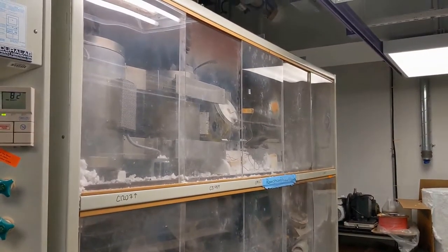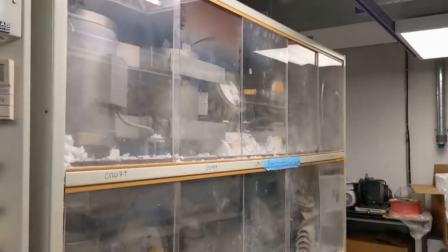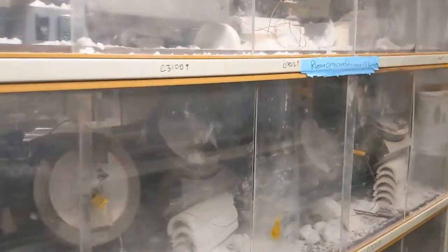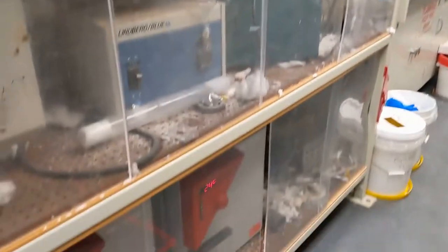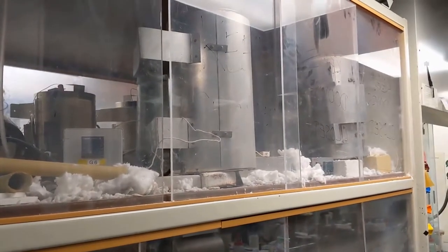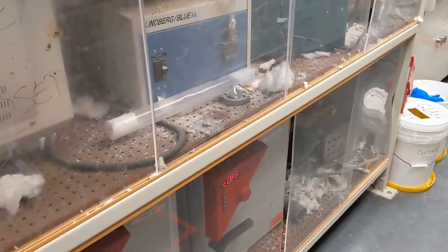Here in the downstairs lab, when you finish sealing your tubes, we have what we like to call the furnace wall. One thing that's unique to our group is just the sheer capacity of how many reactions we can run. We have all of these furnaces on this side, and if we walk around to the other side, we also have furnaces there. Very rarely is there a time where all the furnaces are being used, so you don't have to worry about signing up for specific times to coordinate with others when to run your reactions.